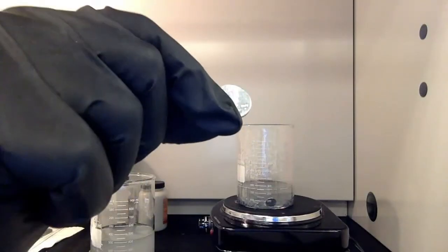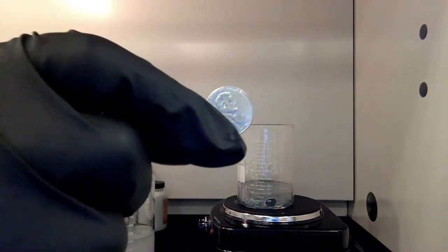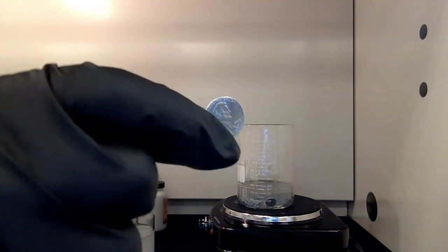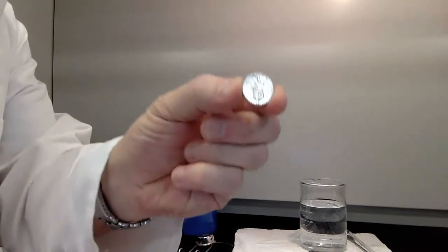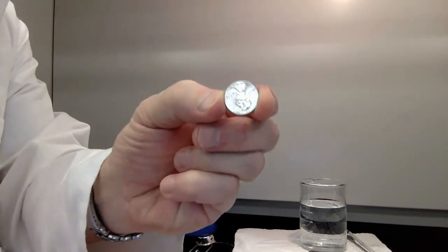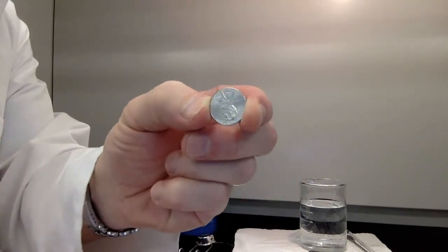I'm going to dry it off now so you can see that there is a layer of zinc on the outside of this penny. It looks silver in coloration. It's ready for us to heat and to make into a gold colored penny. Now the climactic portion of this experiment, changing this silvery colored penny into a gold appearing penny.